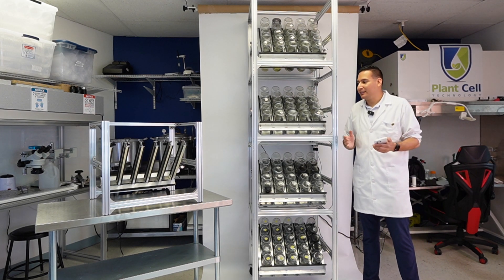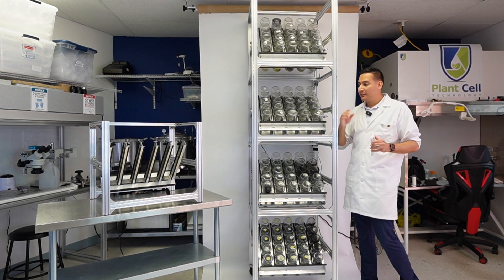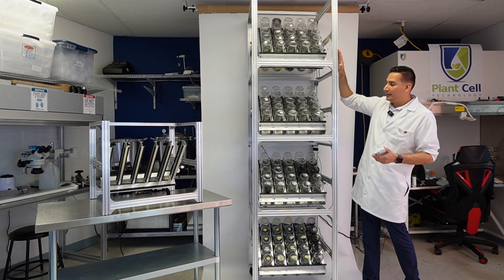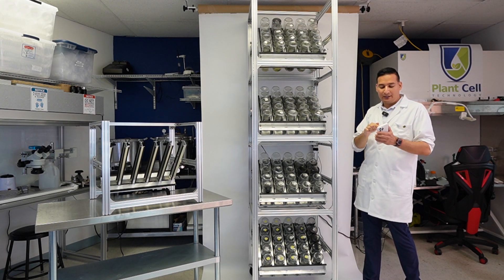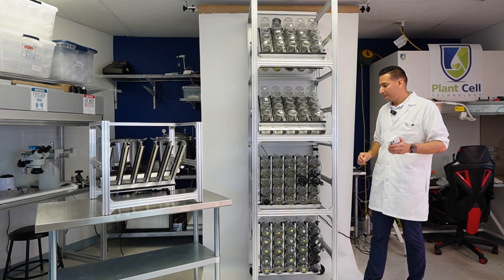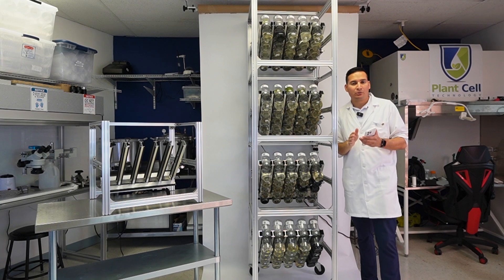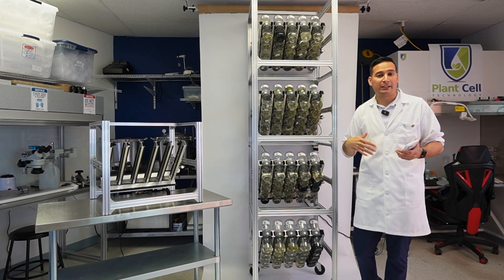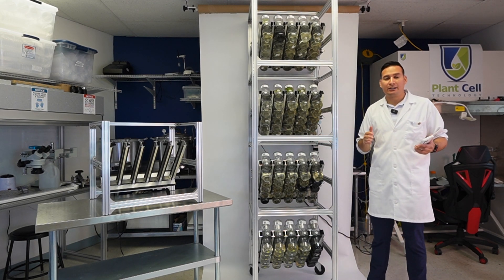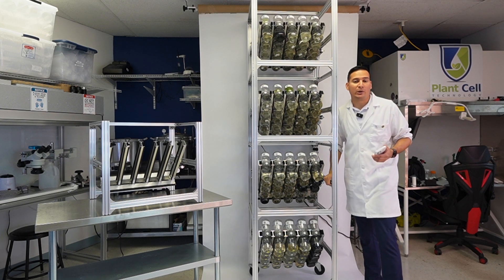All of this is done with an app, and one controller runs four units. With one controller I can independently control the top two units and the bottom two units. If I click this switch, you can see only the bottom ones are moving. The top two and the bottom two are controlled independently.